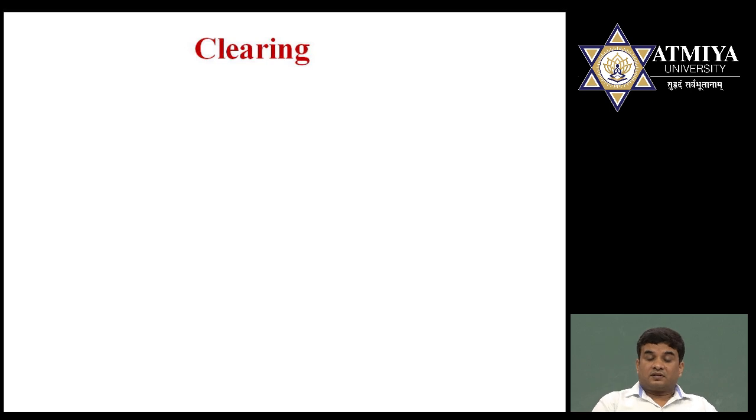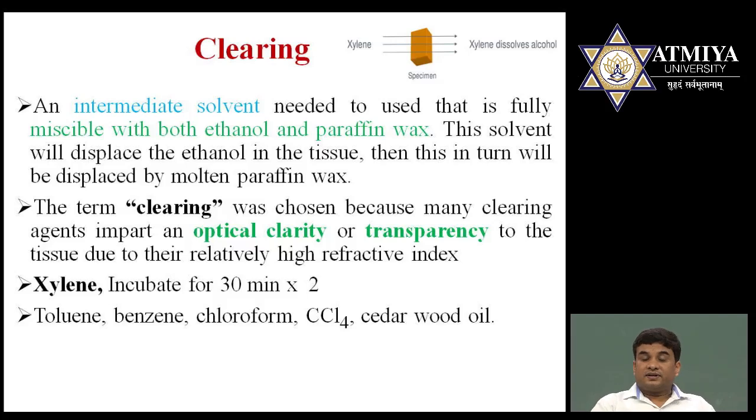Finally, after the dehydration, another step is clearing. Clearing means what? Don't forget, you should always use wax. Now the water is removed, but the dehydrating reagent is still there. The dehydrating reagent you are using here is alcohol, which is not miscible with the wax. So again you need to remove the dehydrating reagent.